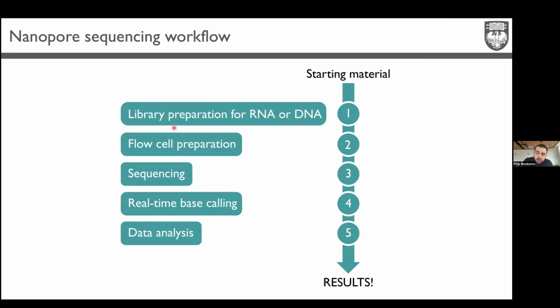So in that sense, it's really nice for you because the library preparation is really made for dummies. You don't need extensive experience to know how to operate the machine. And literally you can bring it here or move it within the lab and it's completely fine. Or even move it from someone else's laptop to your laptop if you want, since this is a smaller device. So in that sense, these are the 2 steps that you do.